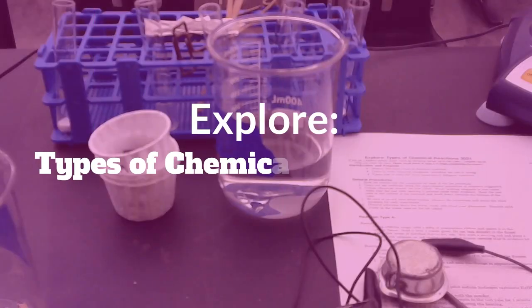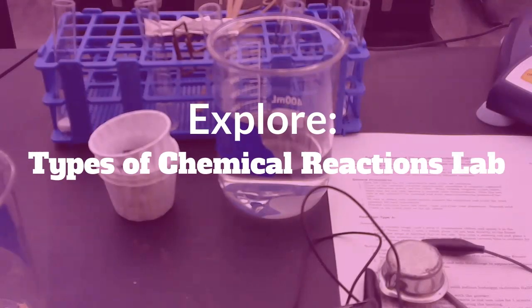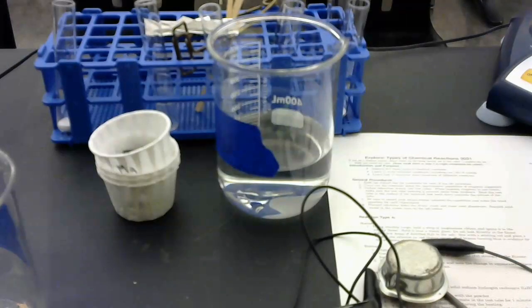Hi everyone. Today we are going to do a types of chemical reactions lab. And this lab is going to be done in class by the students who are in class. But if students are unable to be in class for some reason, then this is a great video for you to go through to help you answer the questions on the lab.